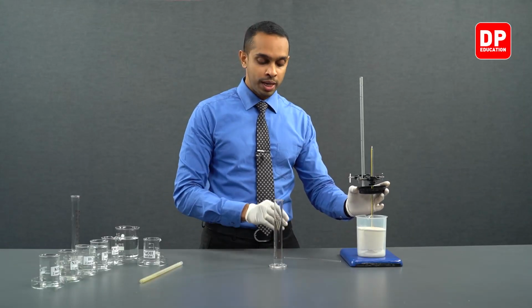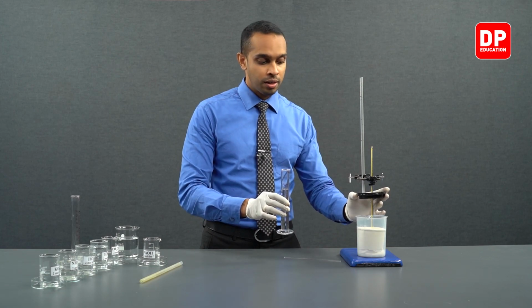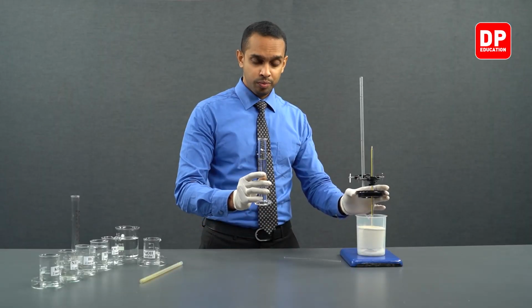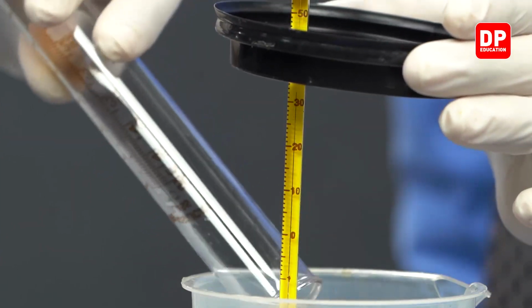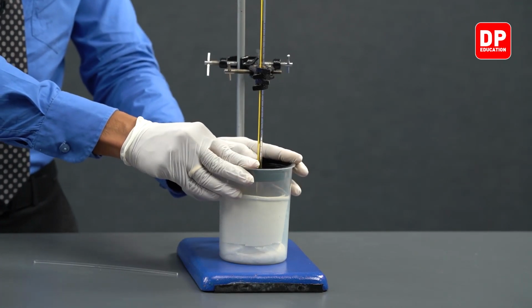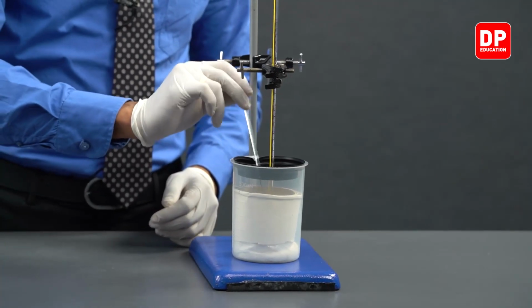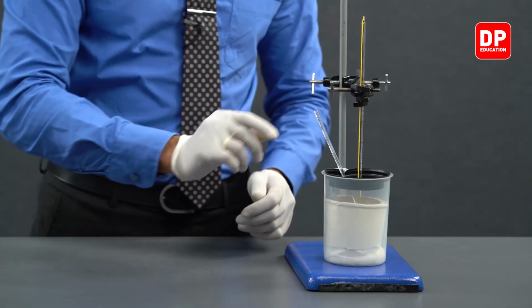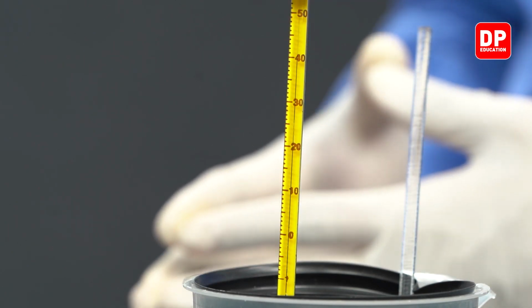As soon as we add the sodium hydroxide, all that is left to do is closing the lid. Now, let's add our sodium hydroxide solution. And we'll close this properly. Using a glass rod, we can stir the solution as well. Now you can see the temperature rising as the reaction proceeds.